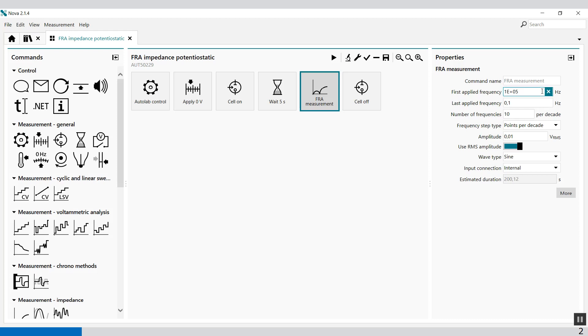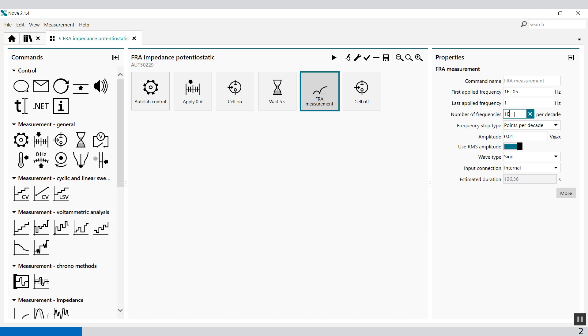First, apply frequency from 100,000 Hz to 0.1 Hz. We can modify these types of frequencies. For example, I want to only go to 1 Hz. The number of frequencies per decade is at this moment set to default to 10, but you can modify it to any value you want.